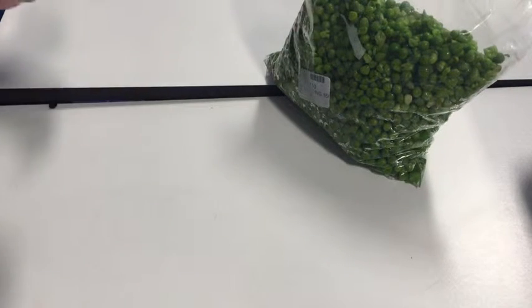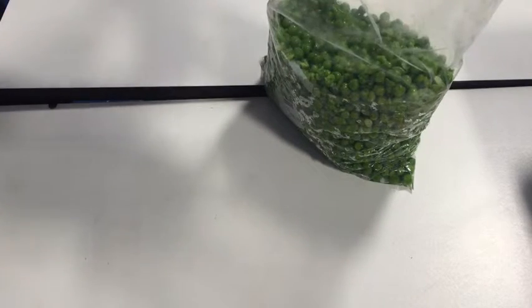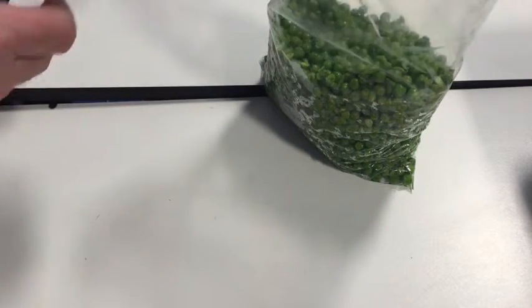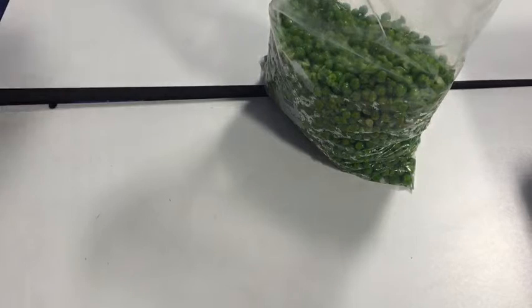Peas are particularly good because they're squidgy. If you do it with something hard it makes it harder to do. The first step is very easy — we take a small scoop of peas, they are a little bit frozen but don't worry, and we put them into a mortar and pestle.